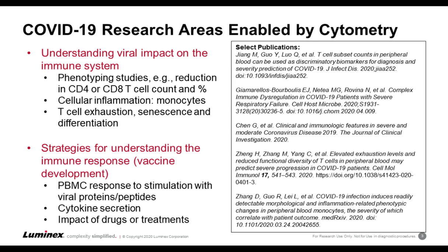So major questions in COVID-19 research by cytometry can span: how does the virus impact the immune system? How does the immune system respond to the virus? Viral entry mechanism, and what drug or strategies can be identified to modulate the virus.